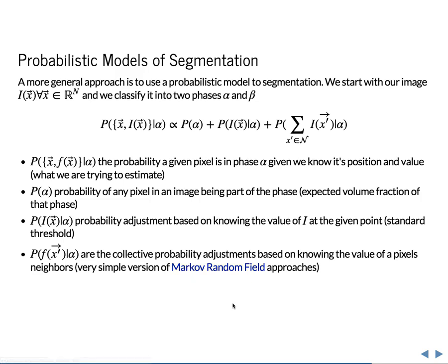And so where you say you don't expect to find single pixels on by themselves, and you can create a Markov random field representation of your image that includes that knowledge in order to perform the ultimate segmentation. That's not something we will cover in very much detail in the class, but that's sort of the approach and the starting point for getting into much more complicated problems.